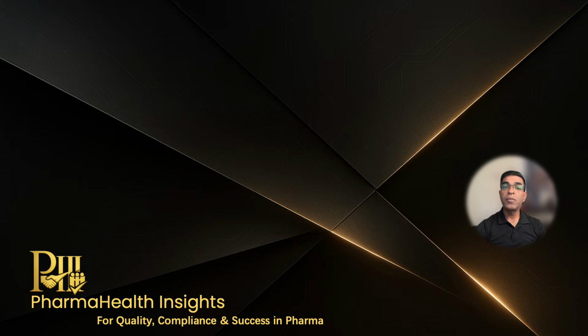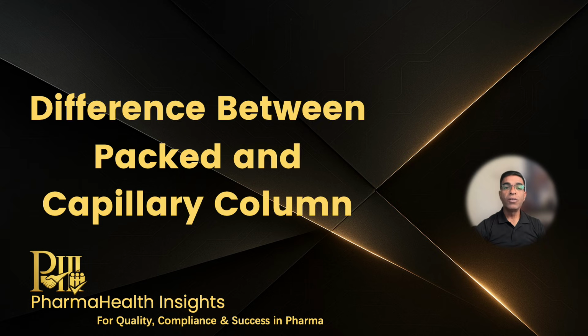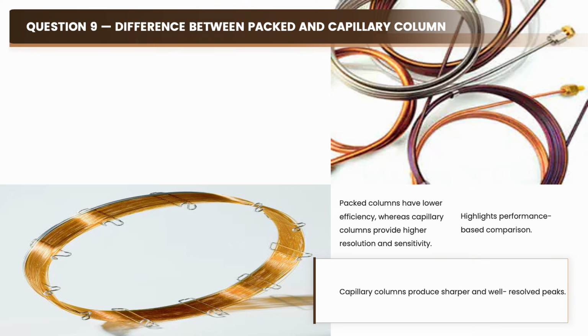Once you mention both types clearly, the interviewer naturally will become curious about how they differ. So the next question will come immediately. What is the difference between packed and capillary column? You should answer like this.